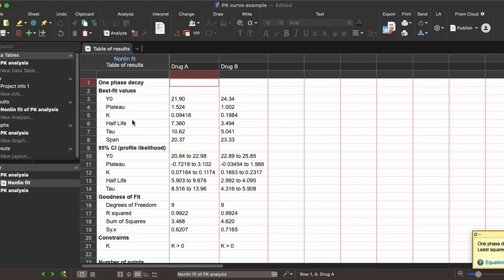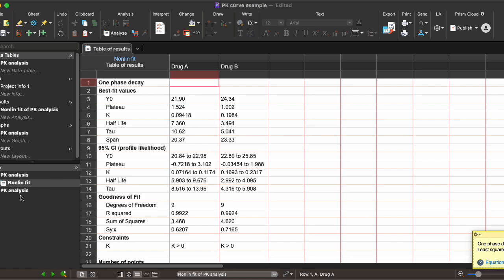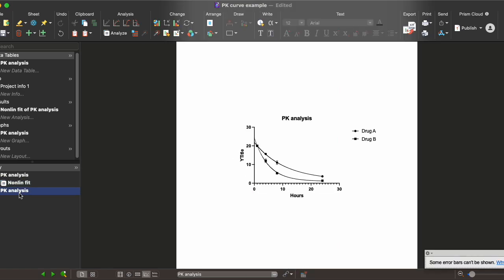Most people are interested in things like half-life, which shows the amount of time taken to reach 50% of the maximum concentration for each data set, or tau, which is the decay constant showing how quickly your drug is decaying. When you click on this nonlinear fit analysis, it also automatically generates the curve and fits it to your actual data points.